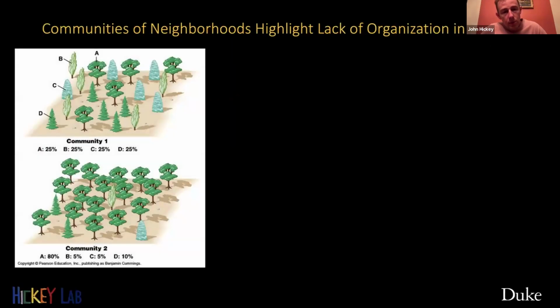One of the types of analysis that we applied is something that we borrowed from ecology, to look at how diverse our ecosystems are. One of these metrics is called Shannon's diversity metric, and that just measures how diverse an ecosystem is, based on the number of species within an ecosystem and the percentage representation from each species.